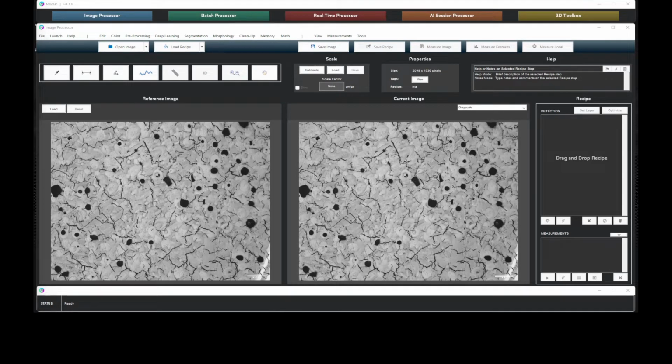Defect analysis can be extremely valuable in predicting final part performance, especially in additive manufacturing. Differentiating between build cracks and pores is critical for characterizing this microstructure, especially because under load conditions, cracks and pores behave very differently.